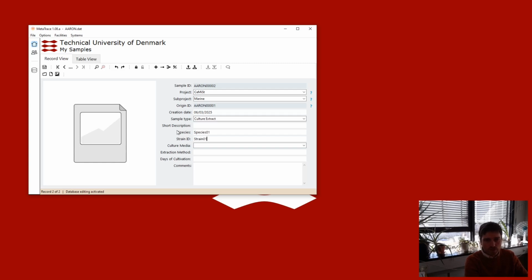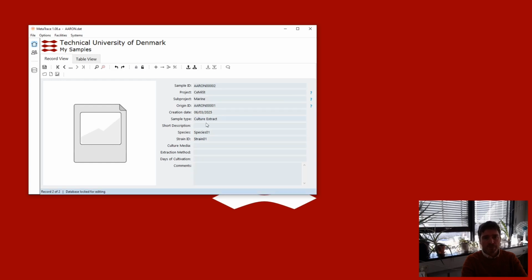And strain 01. Culture media, again, we'll come back to that. And you can type in the way you did your extraction, how many days that culture was cultivated before the extraction, and other comments as well, of course. So that there, and we can then go ahead and save. That there is a simple culture to extract relationship between your own personal records.